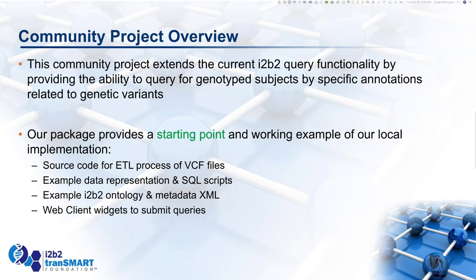We also have a lot of documentation on how we're representing the variant data in i2b2. SQL scripts show essentially just demo data, a few genes and a few subjects that you can load into your demo instance of i2b2 to kickstart and get it working.